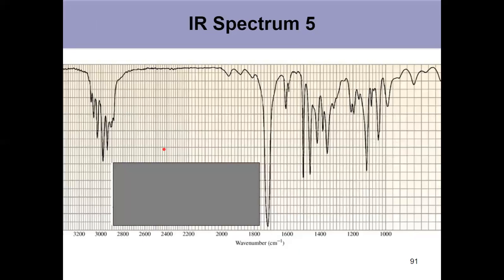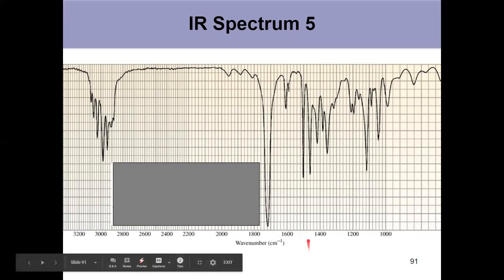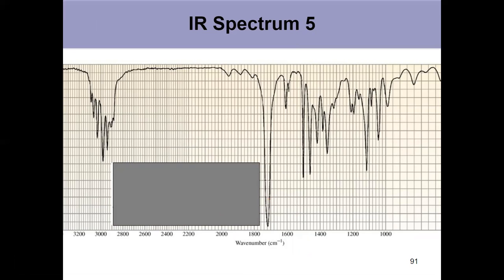One more food for thought, a super obvious carbonyl. This one does end up being a ketone. Notice it's right at 1720 where we expect it to be. What else am I seeing?